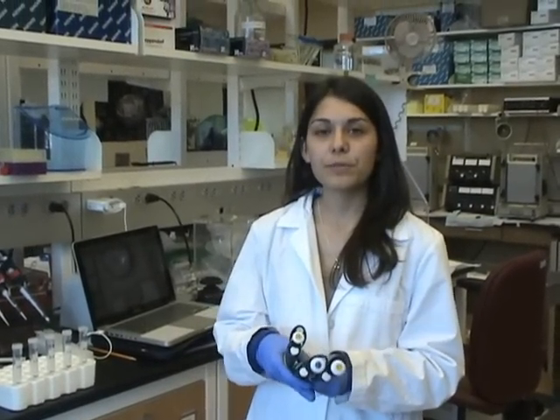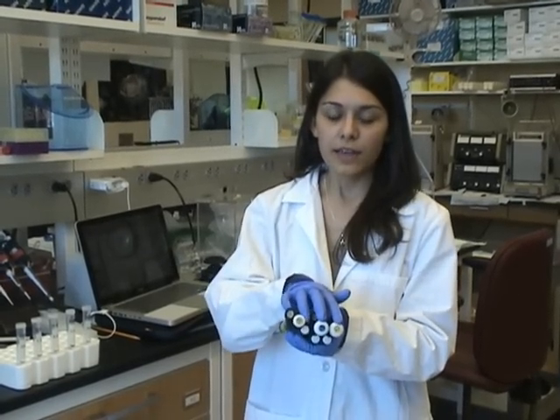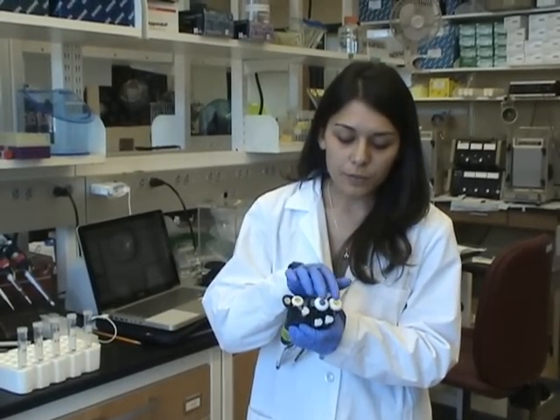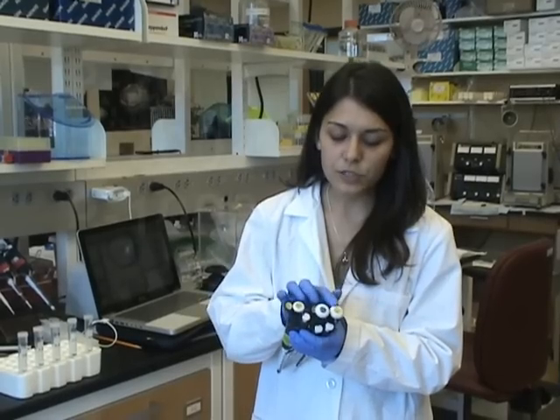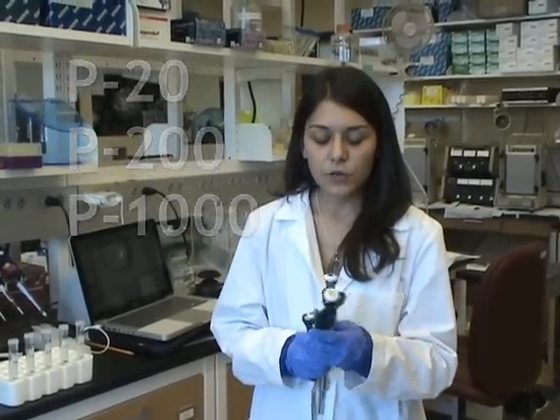Hi, I'm going to be going over micropipettes. I wanted to go through the three of them that you'll be predominantly using in your lab. You can tell exactly which one you'll be using based on what it says right here at the top. There's a P20, a P200, and a P1000. Now let's go over exactly what each one can carry.